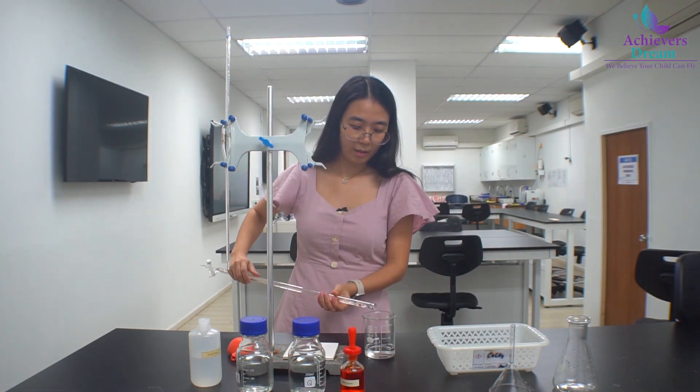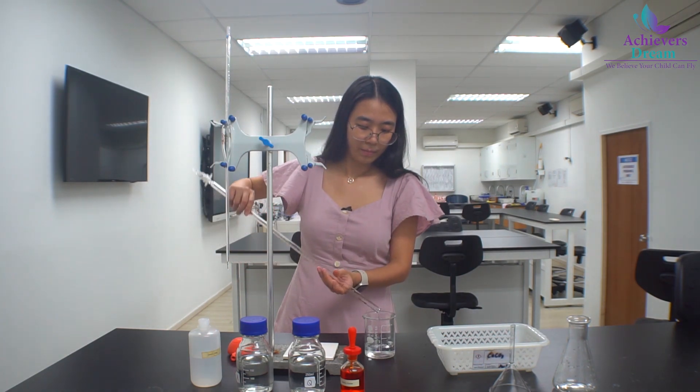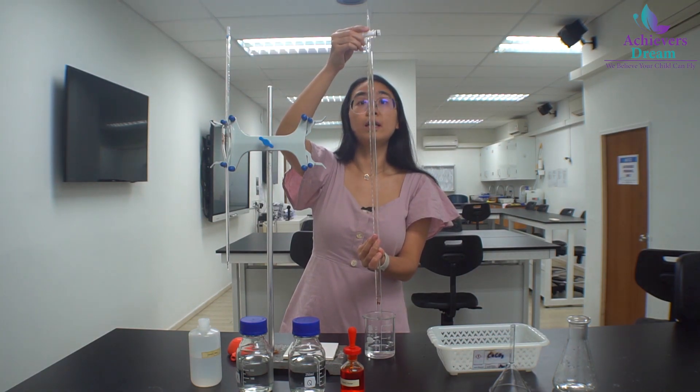Remember to rotate the burette. And discard all the solution, including the solution at the tip.